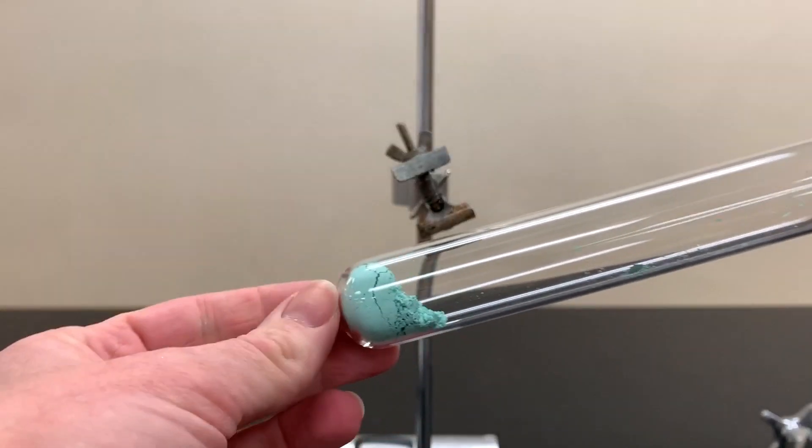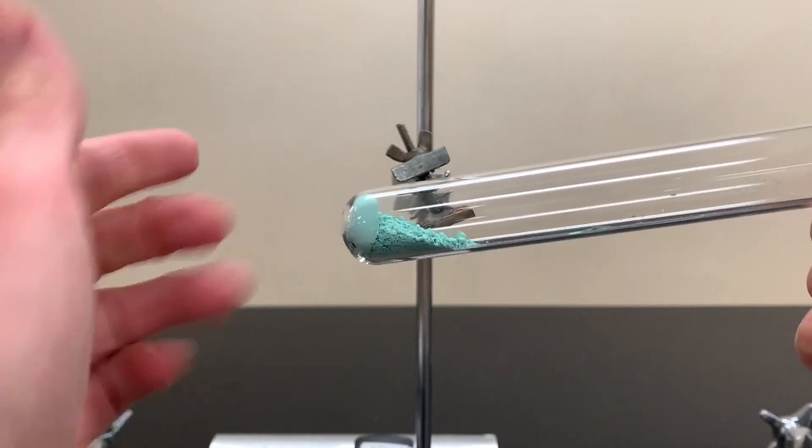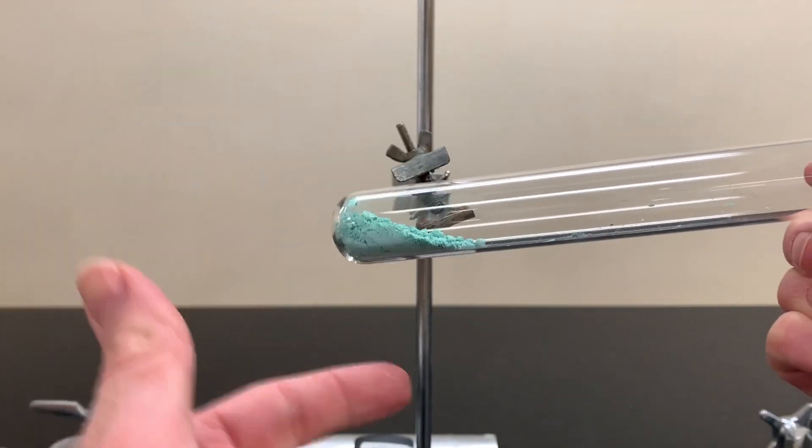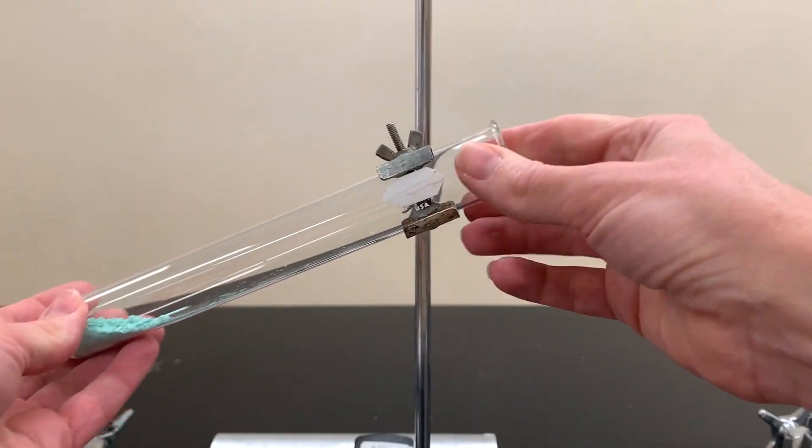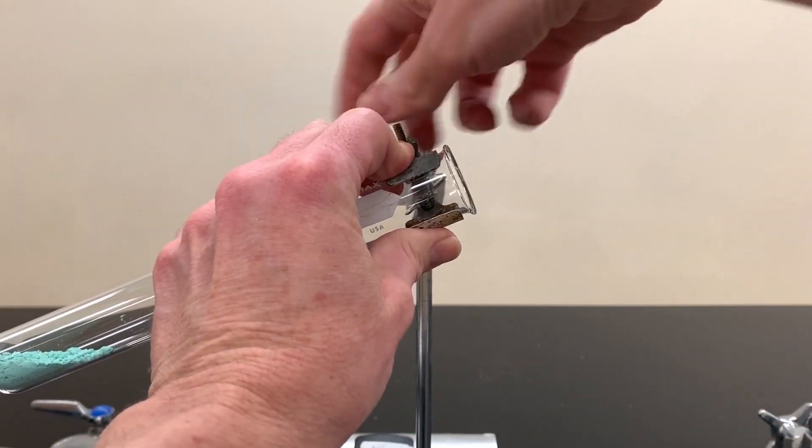The next step is to take your copper two carbonate and shake it down a little bit so it's not all piled in one area. Then put it into your test tube clamp. Try to clamp it closer to the top and tighten it nicely so it's secure.